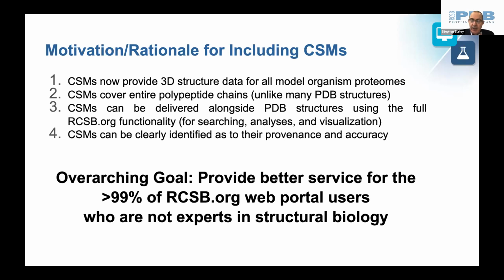They want information across entire model organism proteomes, and are also interested in the parts of the structure that may not be accessible through one or more of the experimental techniques supported by the Protein Data Bank.